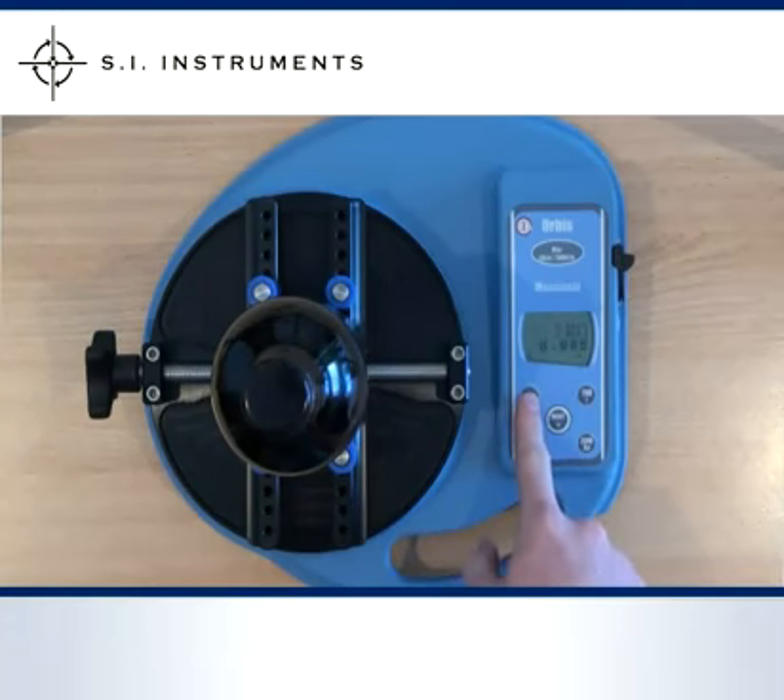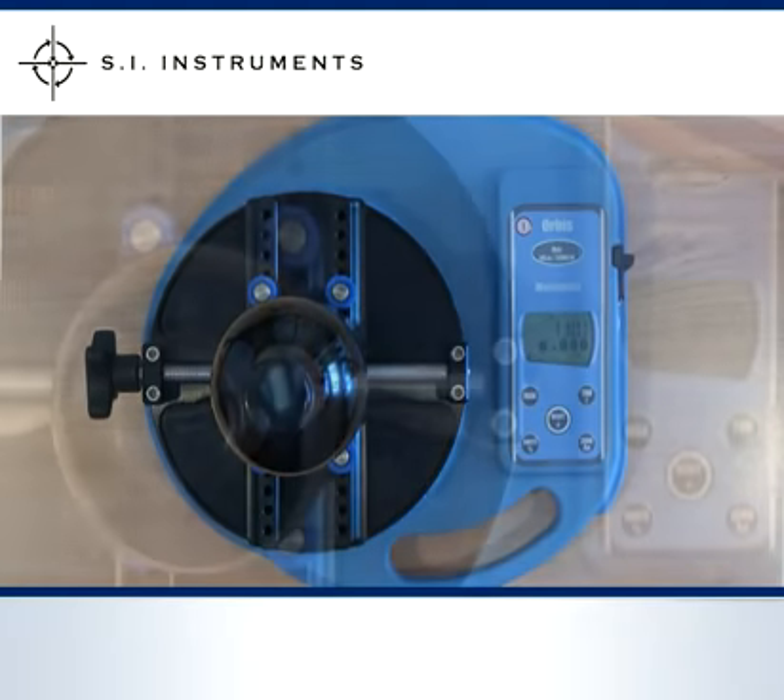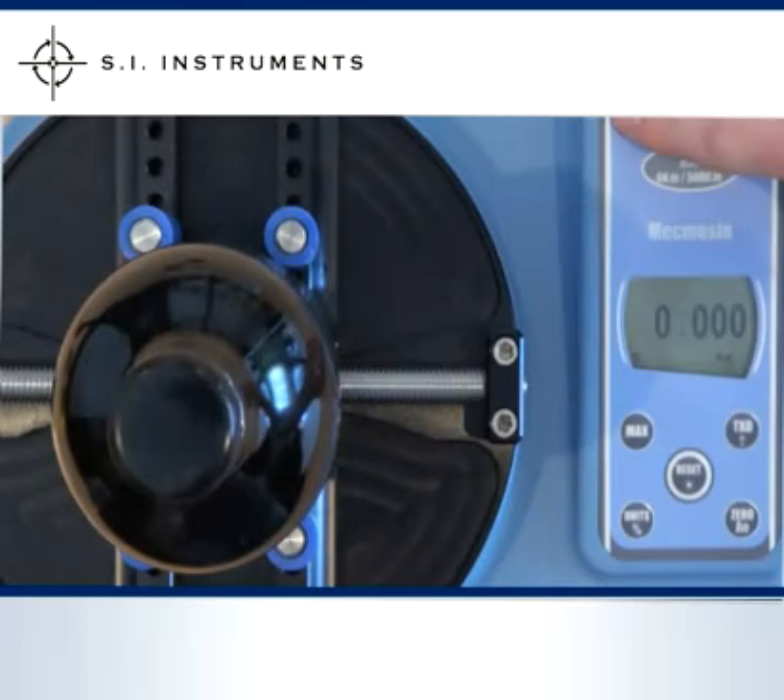Either the non-peak rating, clockwise maximum torque, counter-clockwise maximum torque, or all simultaneously. When resetting the unit it displays on the screen the result of the test and the direction of the test. Similar to the units of measurement, the maximum settings are also remembered at each start up.